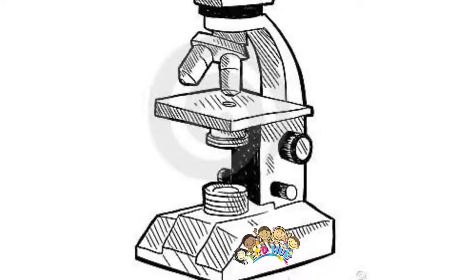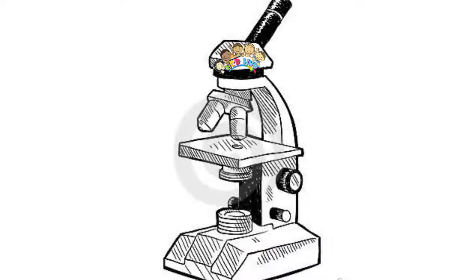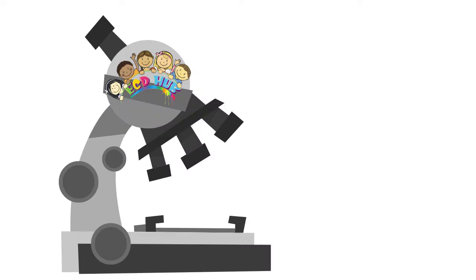While most people picture the compound model from lab class when they think of microscopes, many types of microscopes are actually available. These useful devices are employed by researchers, medical technicians and students on a daily basis. The type they select depends on their resources and needs.